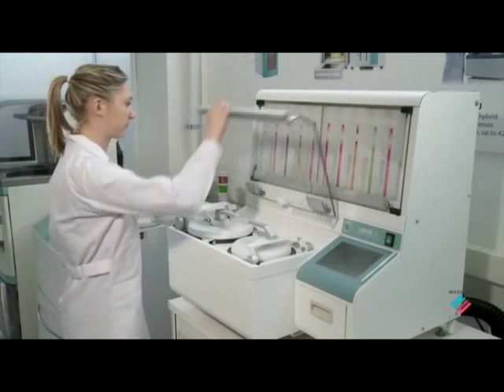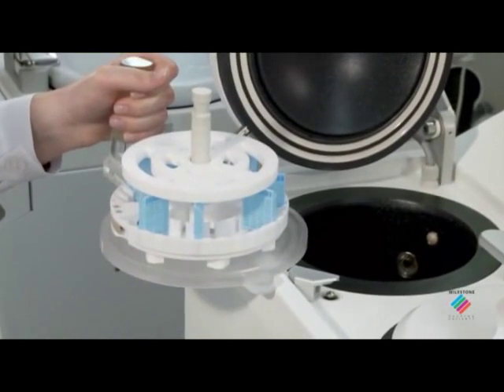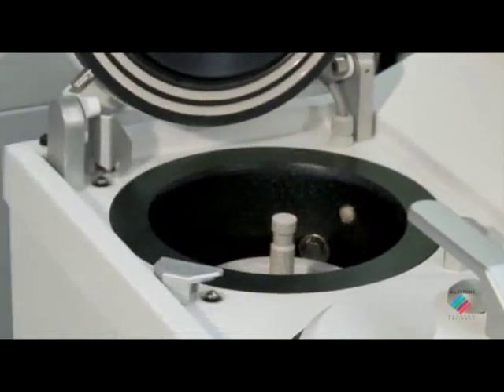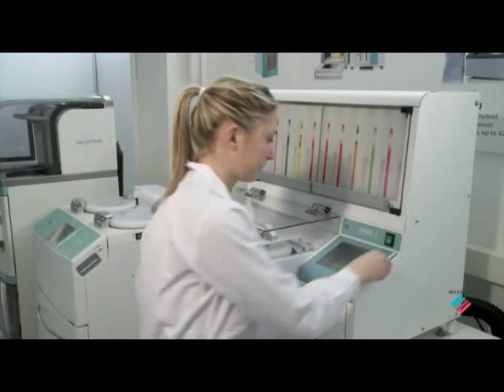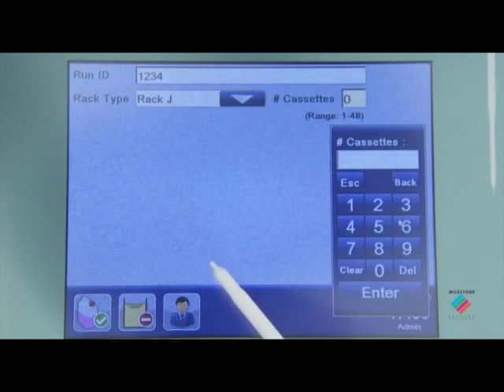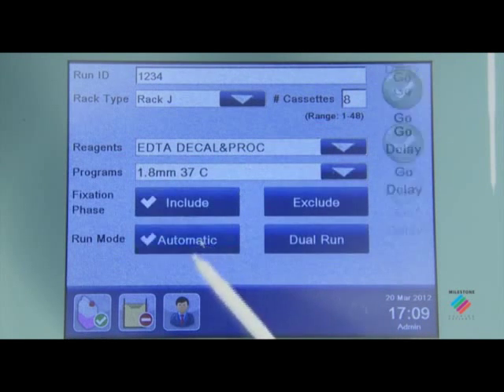Thanks to Logos J, it is now possible for the first time to run fully automated fixation, decalcification, and complete processing of bone marrow samples within 24 hours. Logos J can also perform rapid decalcification with formic acid or EDTA.